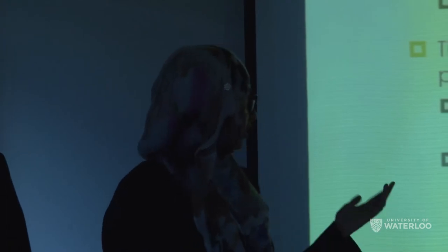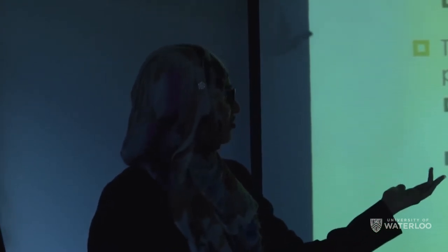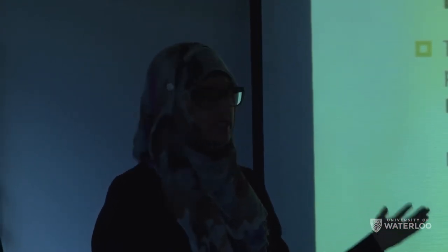Another step that was originally in the procedure was to wash our sample with 5 millimolar HEPES. You would basically centrifuge it, pellet it, and then do some washes to try and remove any free DNA. However, we found that this resulted in a very heavy dilution effect, as a lot of our aggregates actually ended up in the supernatant as well. And you can see in the picture the progression. After the first and second wash, you still see some sample, and after the third, it's basically gone. So again, we decided to take out this step.